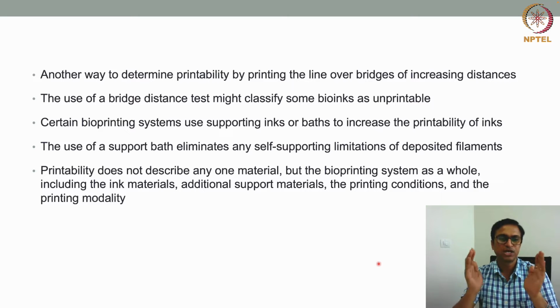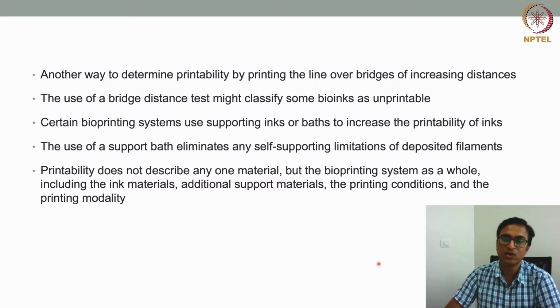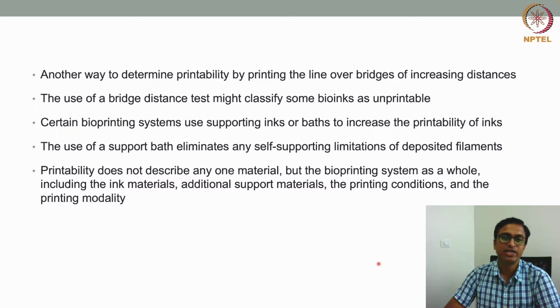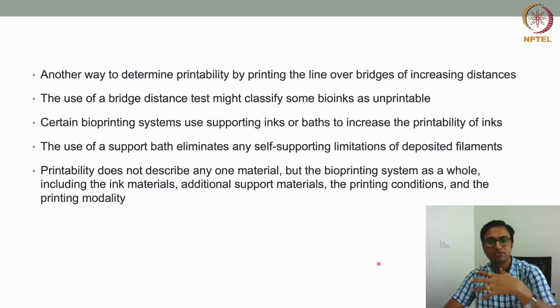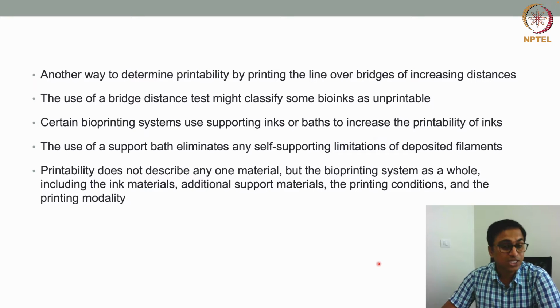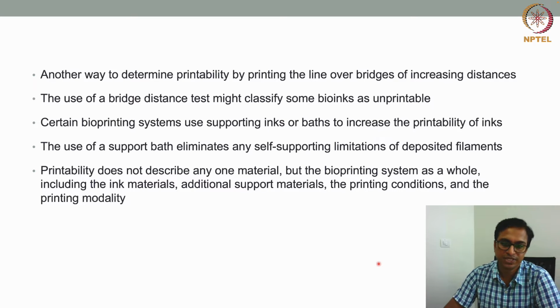Here the support can help to classify several bioinks as printable that would be unprintable in other conventional bioprinting, where the bioink needs to hold itself, the shape should be retained, and it should not sag. All these things can be eliminated by the use of support bath material.